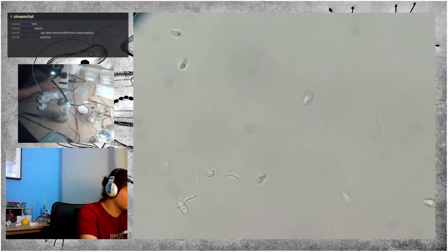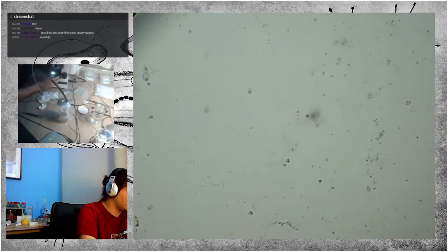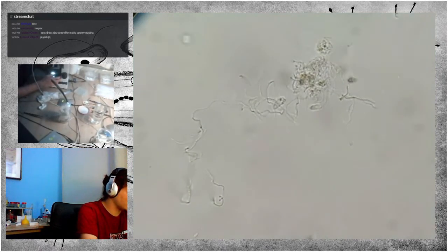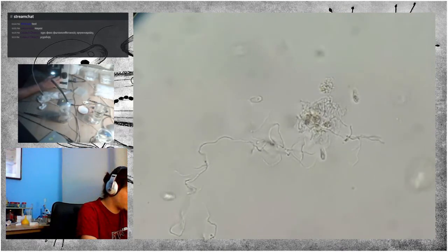Well, we have closed 1 hour and about 20 minutes streaming. Let me get here and see what's going on around the concentrated bacteria.